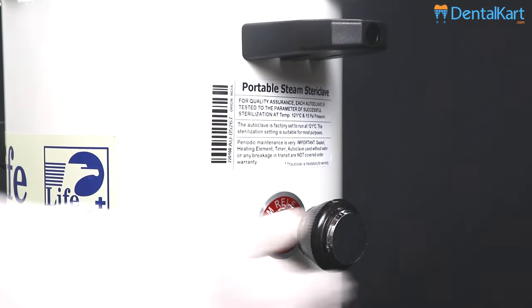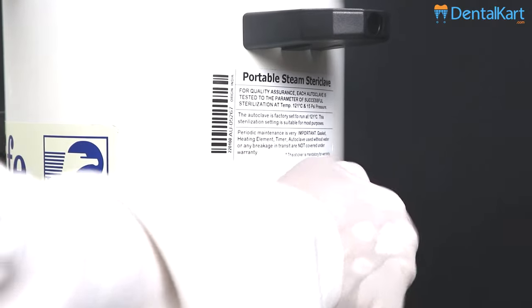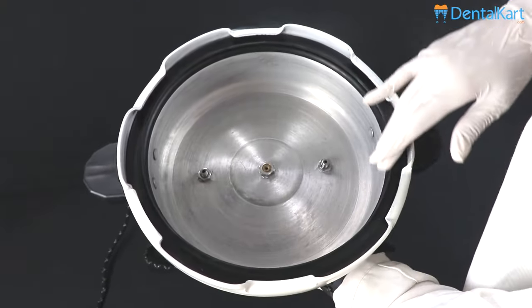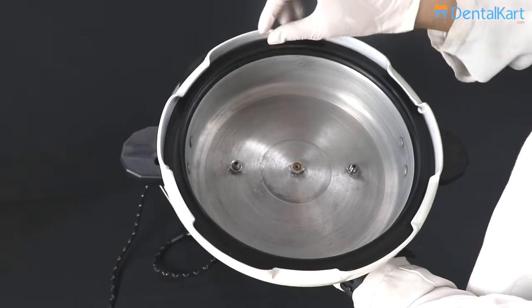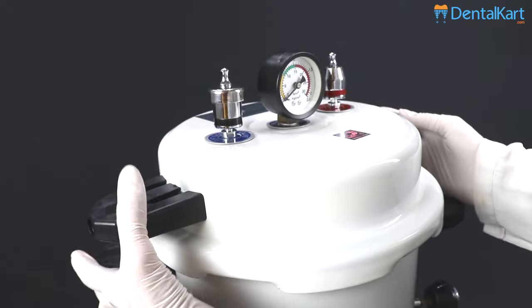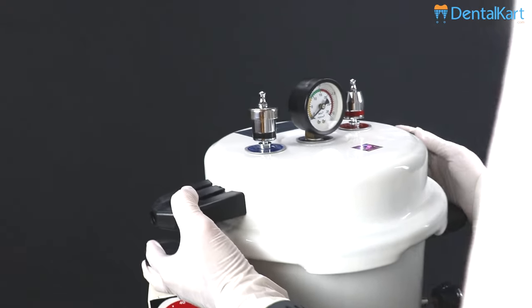Before closing the lid, make sure that the steam releasing valve is open. Make sure that the rubber gasket is not damaged and is tightly sealed. Now, close the lid by turning it in a clockwise direction.